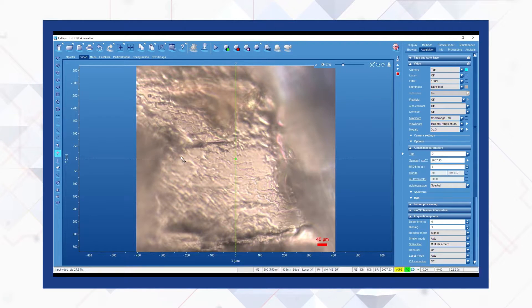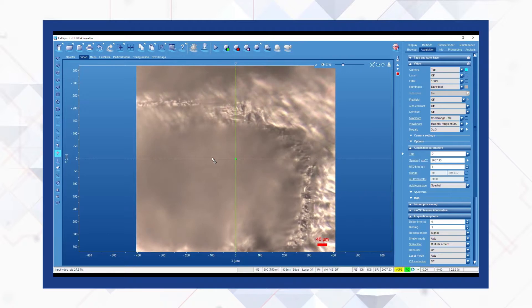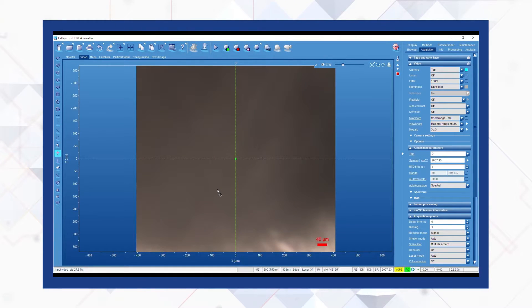Here we are looking at a sample at 50x magnification. You can see that due to the rough topography, it is difficult to stay in focus when you navigate on the sample.